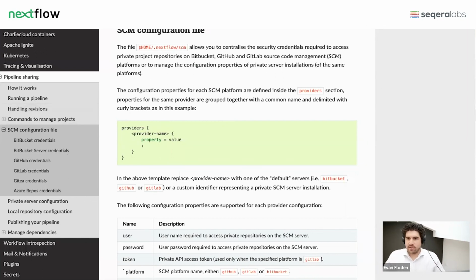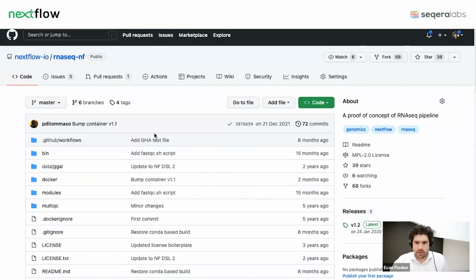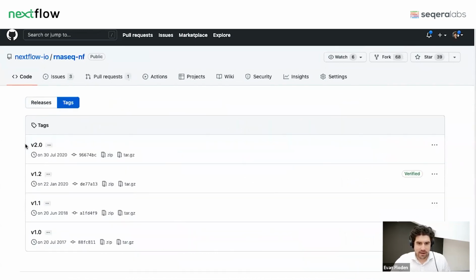The really nice thing, though, going back to the example of the publication, is how do I run a specific version? How do I get complete reproducibility of it? Well, if we consider that we have launched the pipeline with defined containers, and the containers themselves are the whole environment, all the versions of the software, everything's completely locked down in that regard. I can also say, well, I want to run a specific release. Like, I want to run version 2.0, which was released 2 years ago in this case, or some particular analysis.